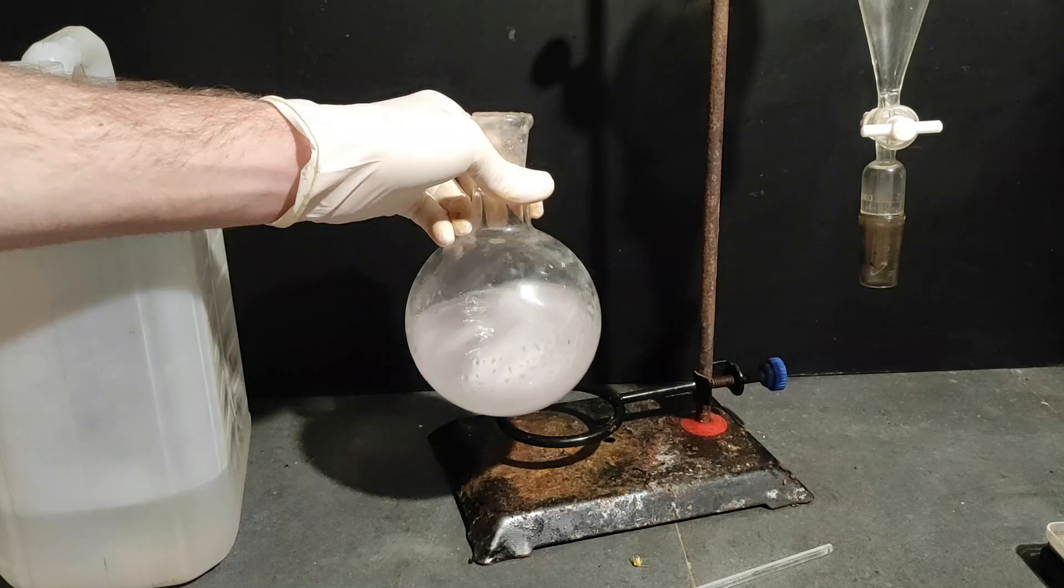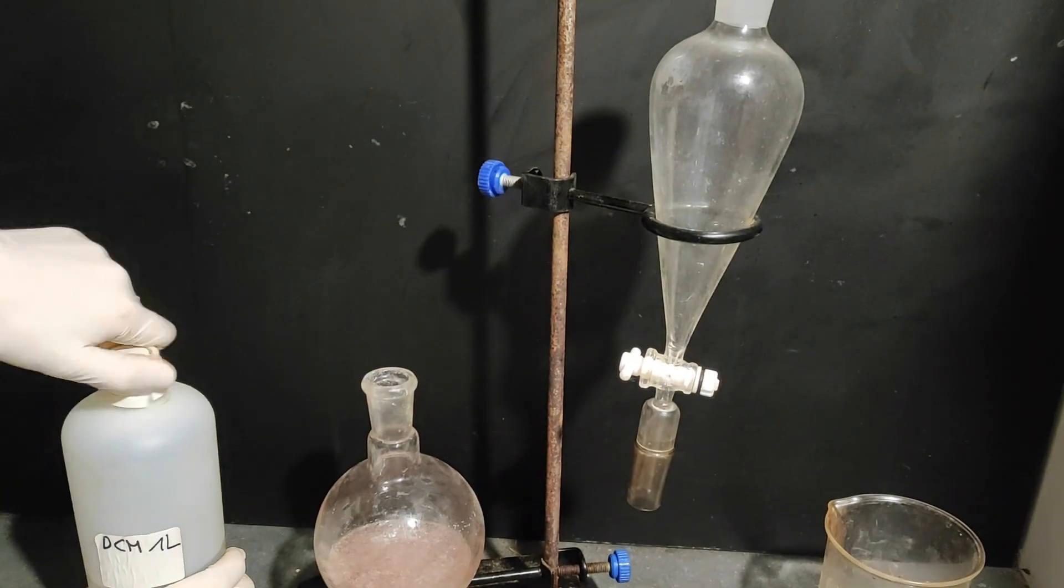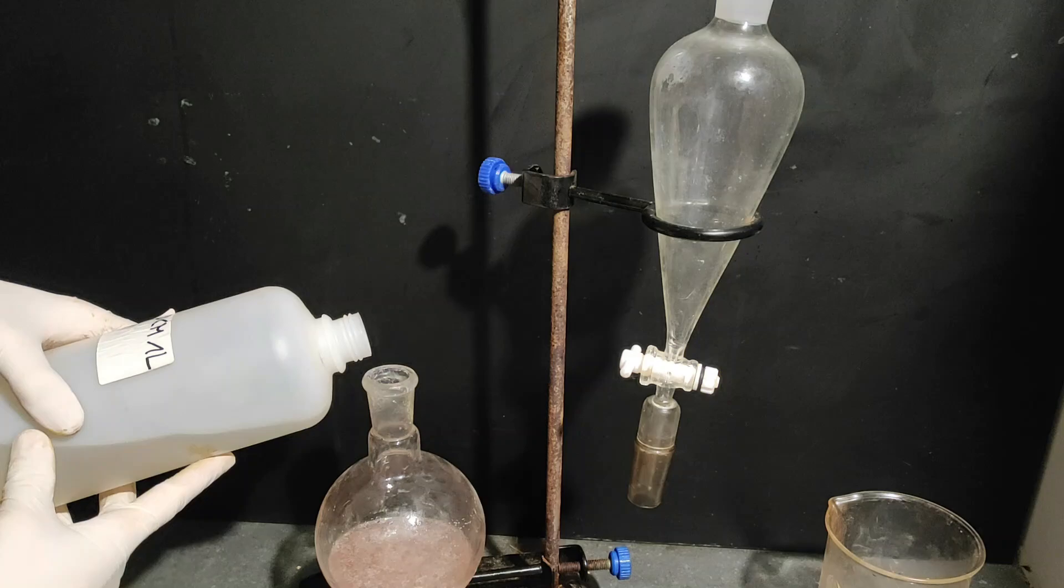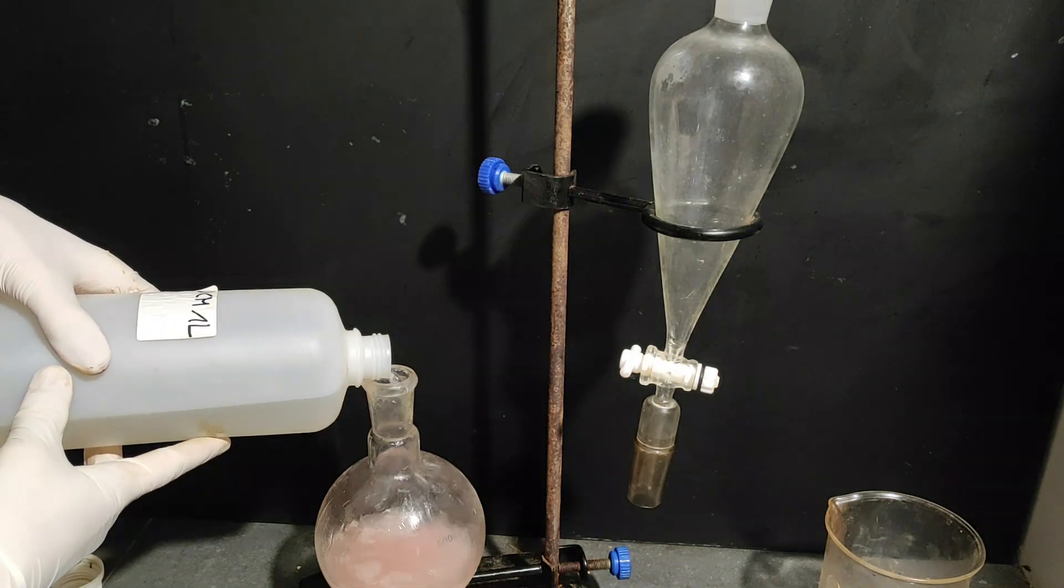Now after some time most of the acid should be neutralized and we should add a solvent called diethyl ether but I don't have any at all so instead I added what is called dichloromethane and transferred everything into this separation funnel.